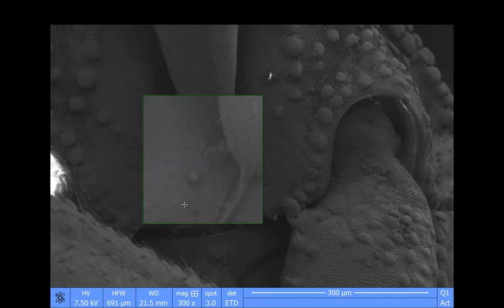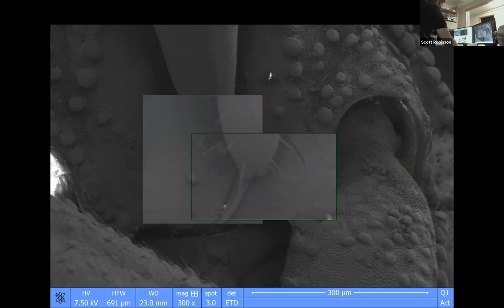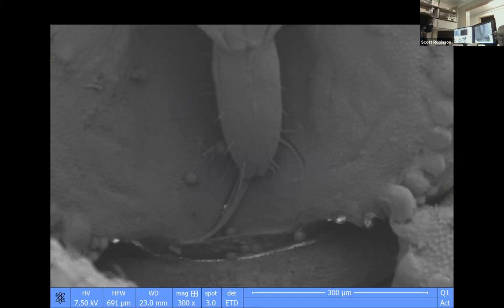And then what's really interesting is it has this little feature where it looks like it can make noises. All those little ridges. Oh, yeah. A couple of assassin bugs can squeak. I don't know if I've ever heard these guys squeak, but they'll basically rub the rostrum against that grated area, and it'll make a sound. I don't remember what it's used for. That's cool. You can really see that up close.